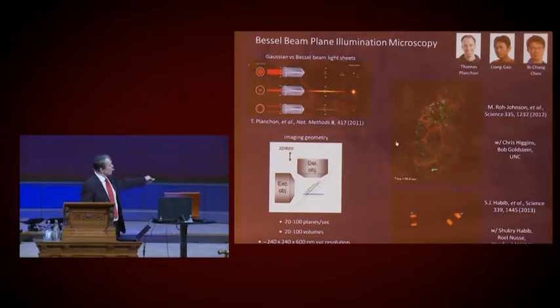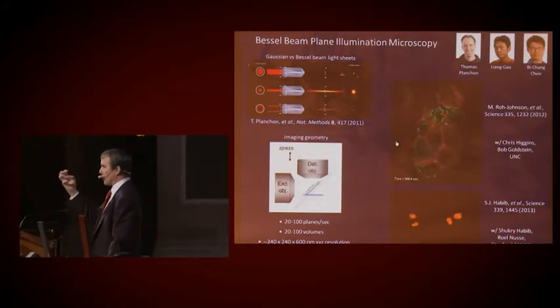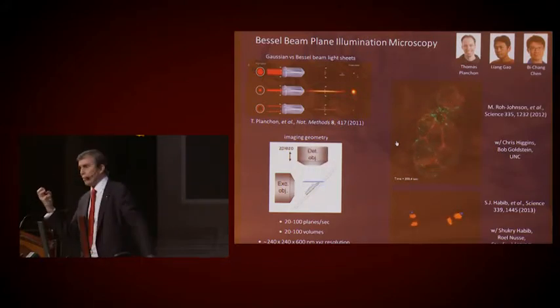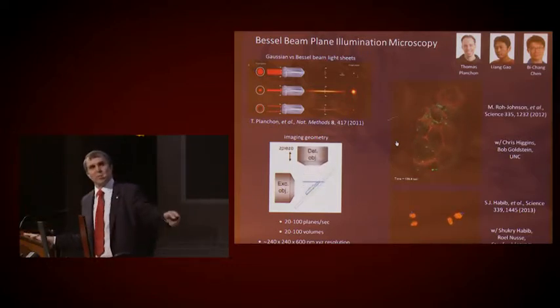Here's a couple early examples where we're looking at the initial stage of gastrulation in C. elegans embryo, and with our collaborators, we're able to show the myosin in green, which represents those actin myosin contractions. They generate the forces, but the forces occur before the cells gastrulate. And so there has to be a yet unknown clutch mechanism which couples those forces to the membranes.